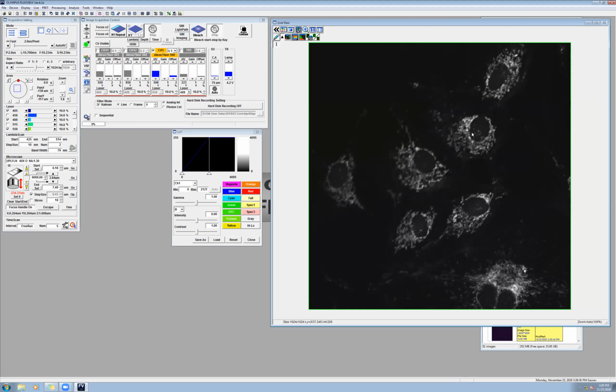If you are looking at vesicle-like structures, you definitely want to zoom in manually, and then you also want to use a 1024 by 1024. If your goal is to have a nice publication quality image which goes into a paper, I would definitely image that using a 1024 by 1024, because then if you zoom in to a particular image, it won't get pixelated anymore.